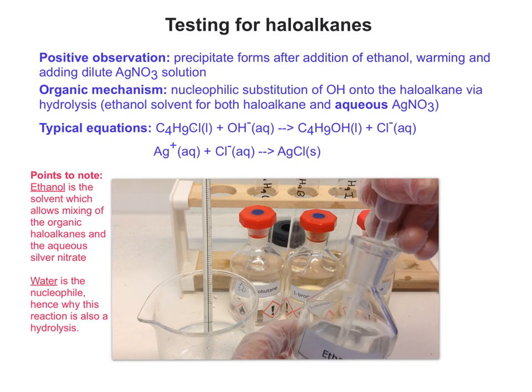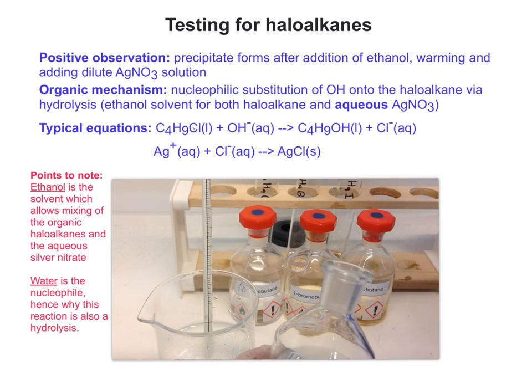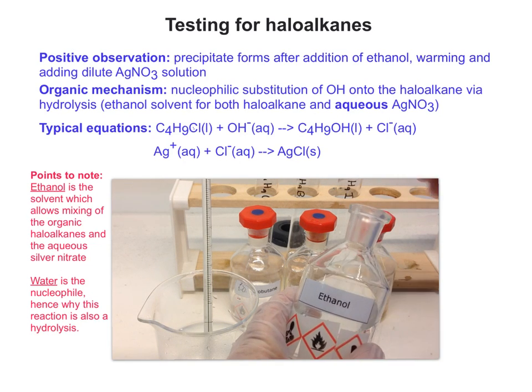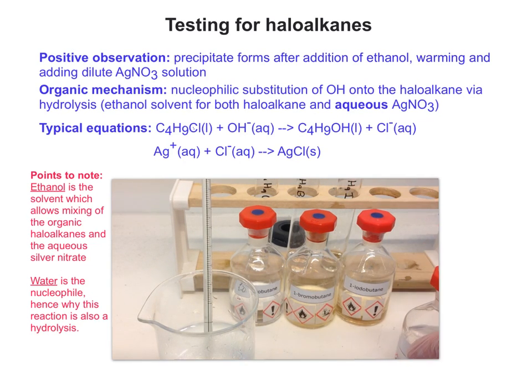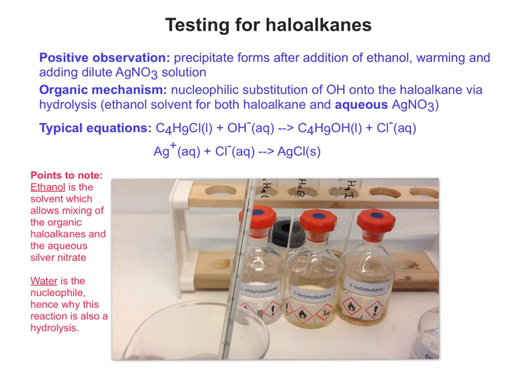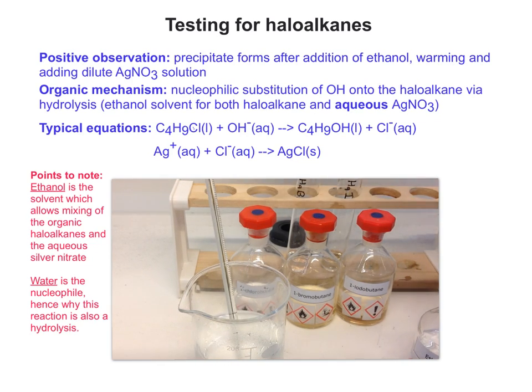So the water that the silver nitrate solution is dissolved in acts as the nucleophile. So it's not actually, as some people sometimes mistakenly think, the OH minus from the ethanol. The ethanol doesn't dissociate into OH minus and part of the molecule. What it does is allow the haloalkane and the water to mix properly.